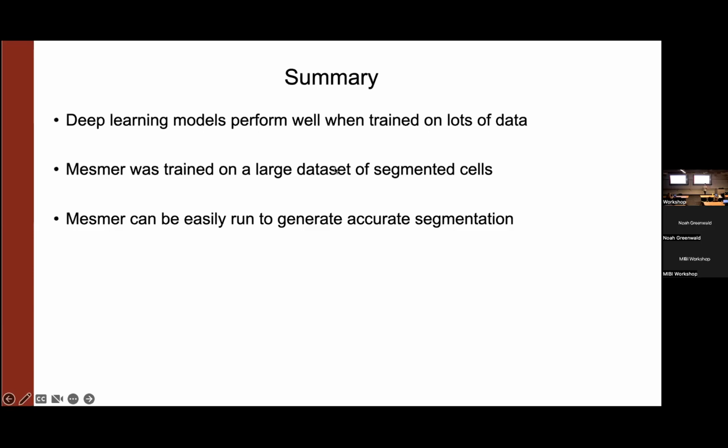The model is going to assume that either way, it'll get the nucleus. And if there's enough information to get the shape of the cell, it'll then expand that out. Otherwise, your cell segmentation will look very similar to your nuclear segmentation. So you don't have to do anything fancy and change the inputs. If you don't have a membrane marker, that's okay. You just give a blank channel for the membrane marker and supply the nucleus.